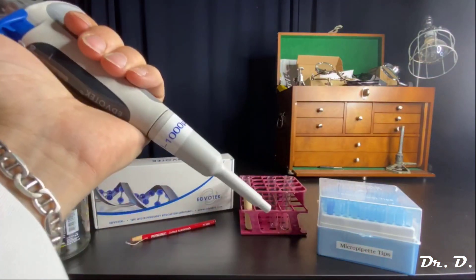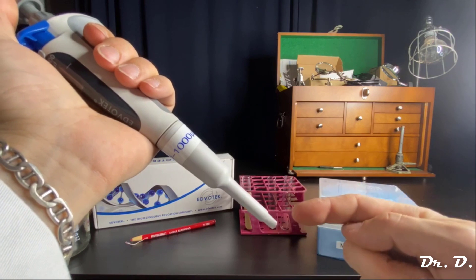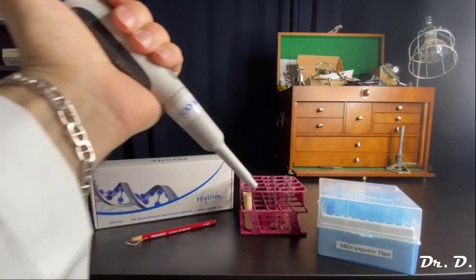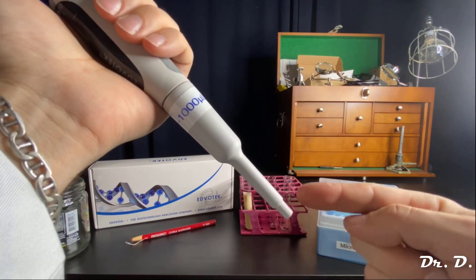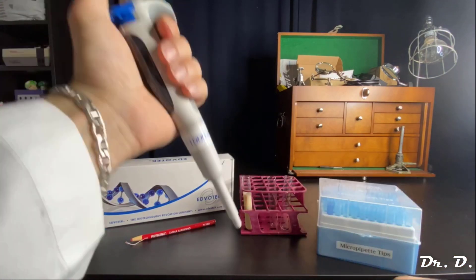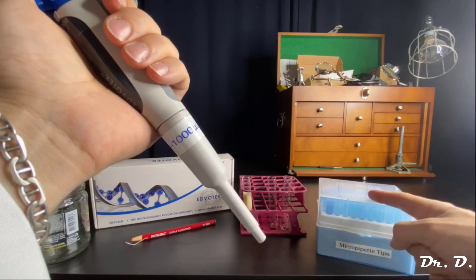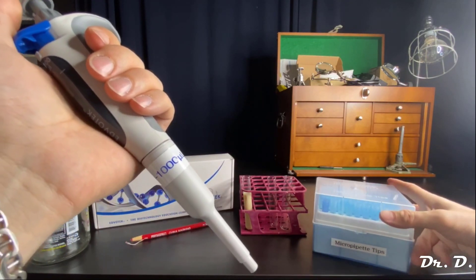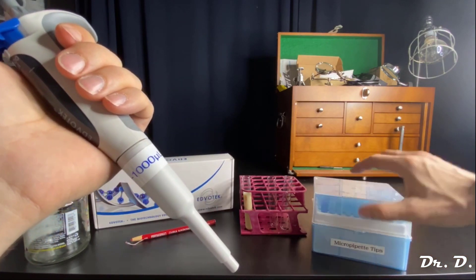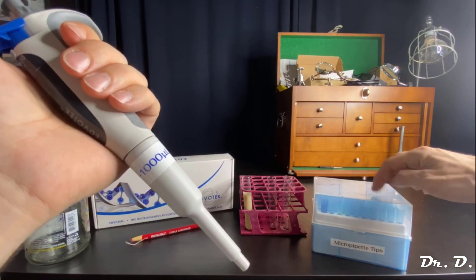Now I need a tip. I always use a fresh tip when I want to aliquot solutions. I never dip this micropipettor into a solution without a sterile tip. These tips are usually sterilized and you will open this up. Micropipette tips. These are the P1000 micropipette tips.